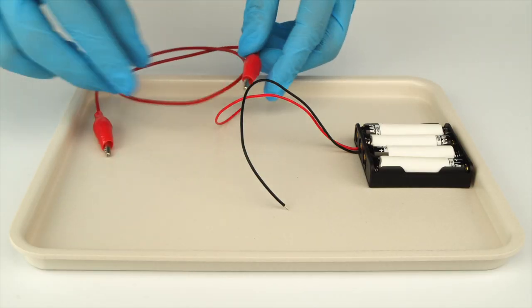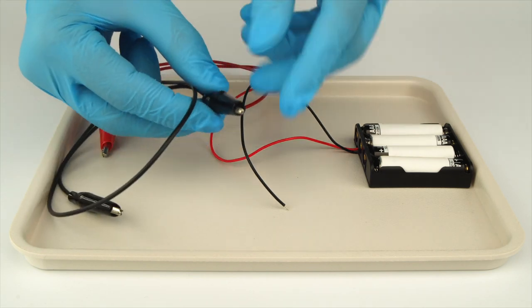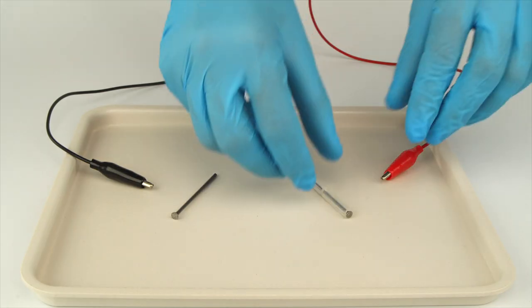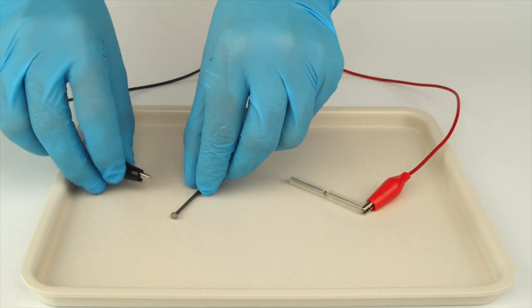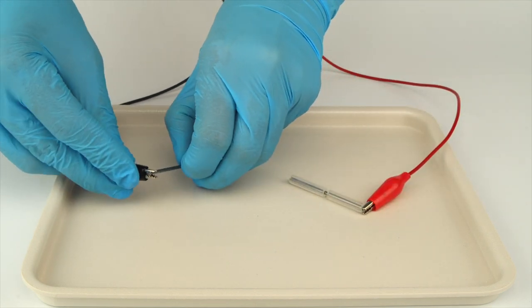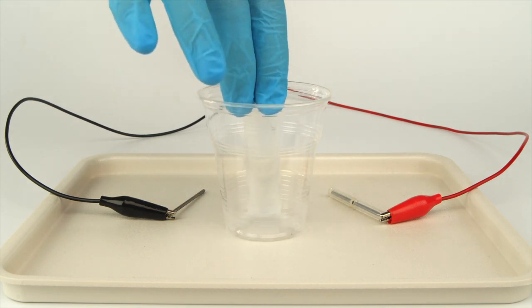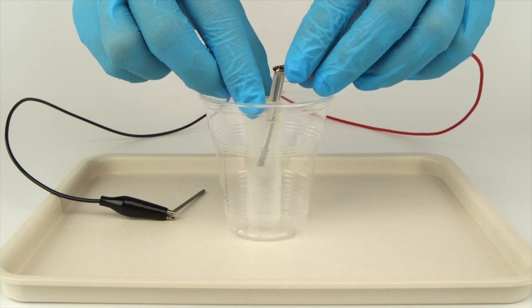Connect the red crocodile clip to the red wire and the black crocodile clip to the black wire. Connect the red crocodile clip to the head of the protected nail and the black crocodile clip to the head of the unprotected nail. Put the nails connected to the batteries into the salt solution. Make sure the crocodile clips aren't touching.